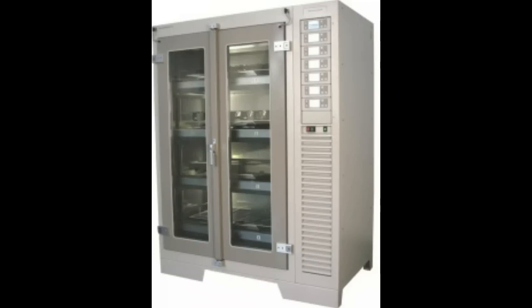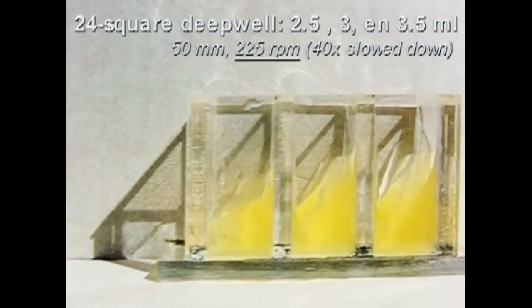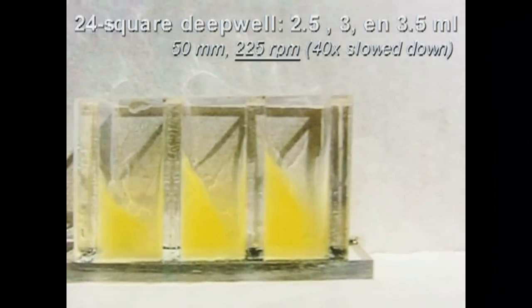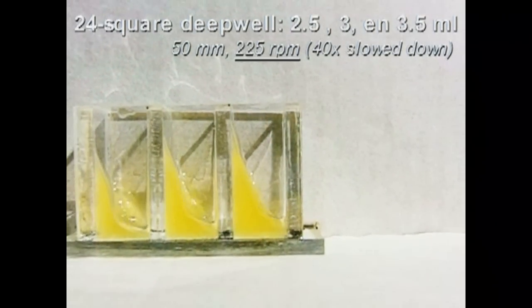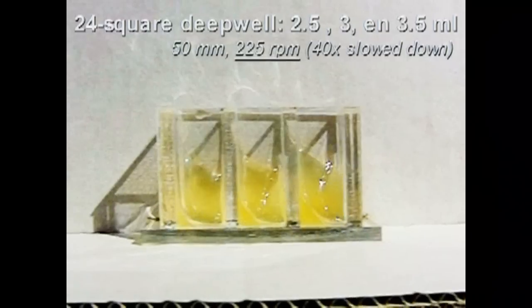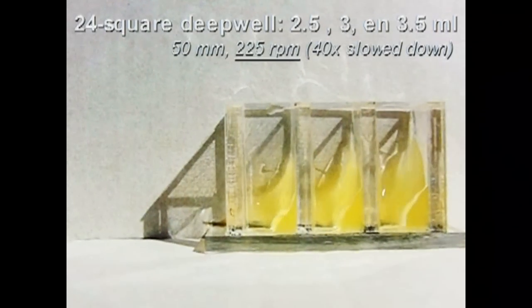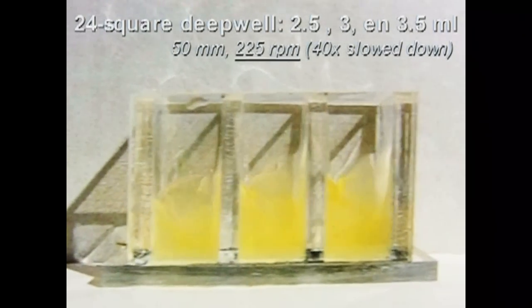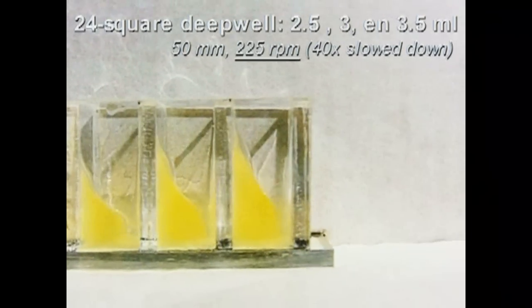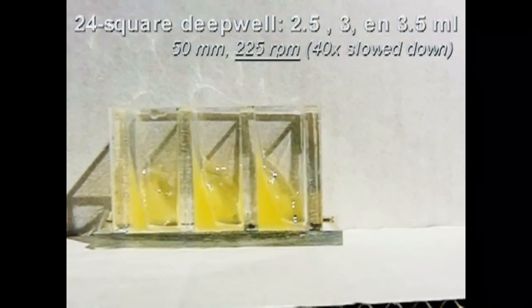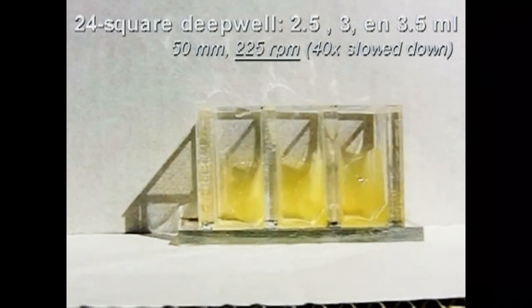The shaker cabinet does not need to be humidified for most purposes. The culture evaporation rates are usually already sufficiently limited by the sandwich covers. If the evaporation rate should be further reduced, we advise to apply no higher humidities than 75%. Higher humidities lead to fungal growth inside the shaker cabinet and may as a result negatively affect the health of laboratory workers.